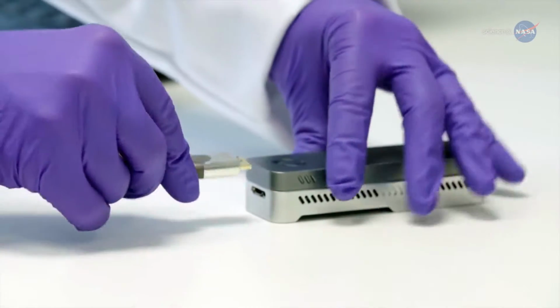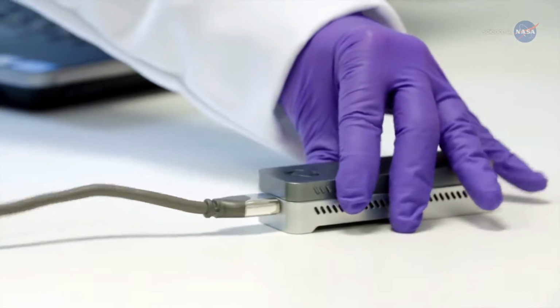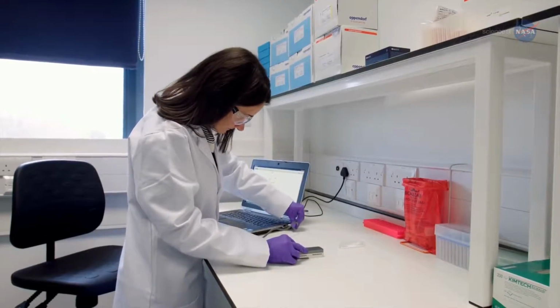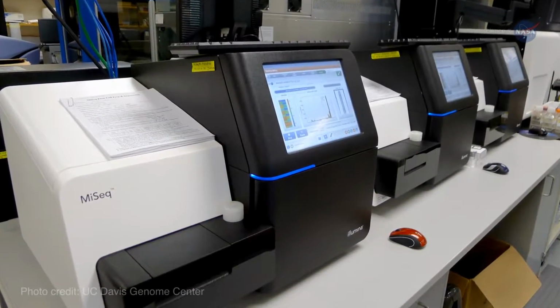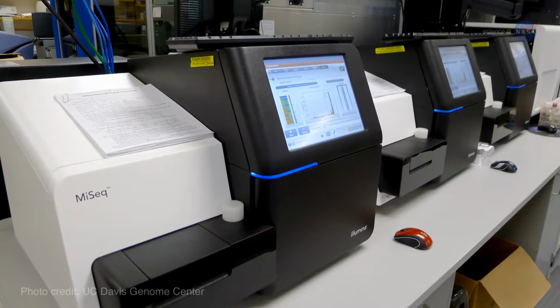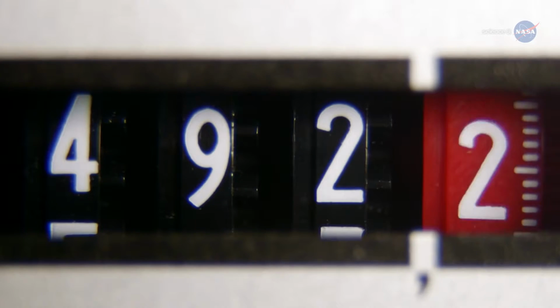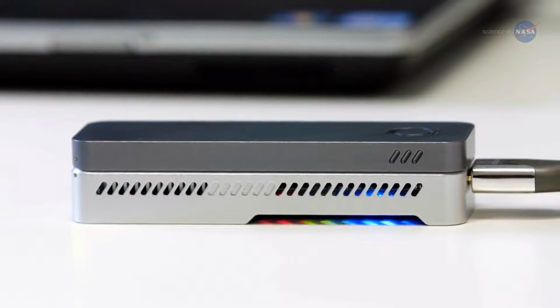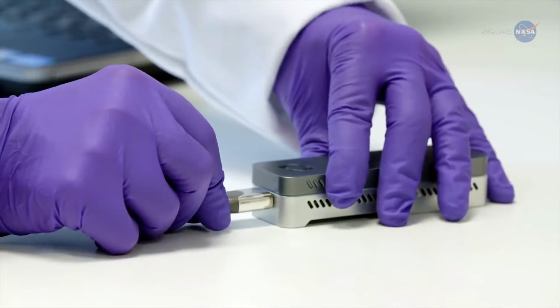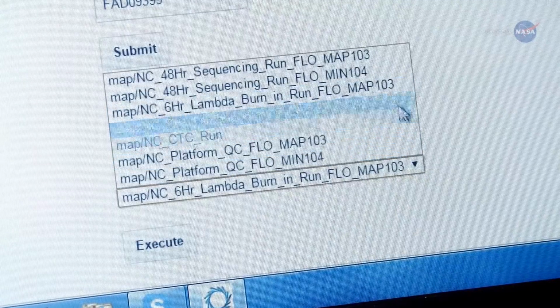The USB-powered sequencer, about the size of a small candy bar, is tiny compared to the large microwave-sized sequencers used on Earth. Castro-Wallace says most sequencers in Earth-based labs involve optics, fluorescence, lasers, and other vibration-sensitive components that are not suited for spaceflight or microgravity. "There is huge power consumption at play with those as well." MinION, on the other hand, has minimal moving parts and plugs directly into a laptop or tablet, which supplies power to the device and collects the sequencing data.